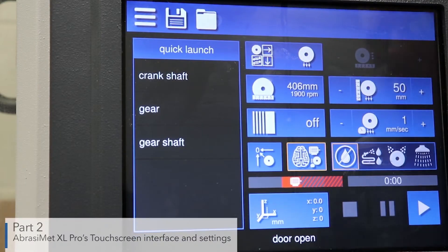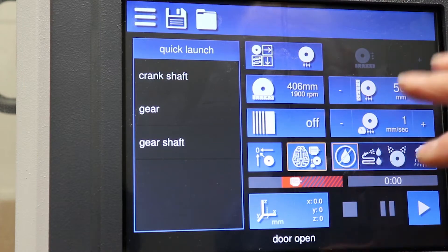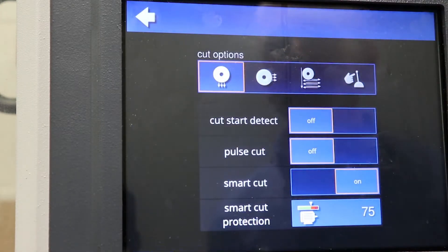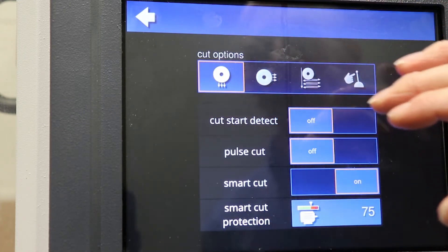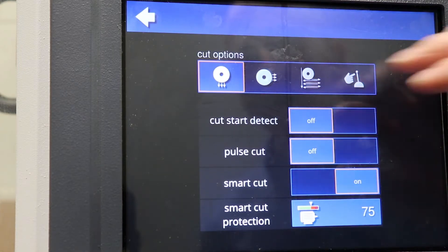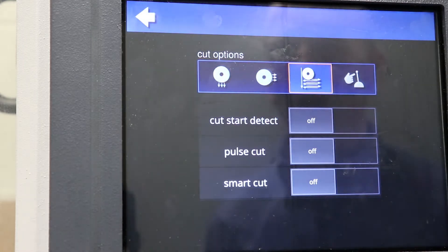This is the control panel for the Abracomat XL abrasive cutter — very intuitive and easy to use, with a touch panel for setting up all of the controls for a given cut. Some cut options in here: you can select your cut option very easily. This would be for cutting in the Z direction — a typical chop type cut. You can also set a Y cut where the vice bed advances toward the blade and cuts in the Y direction. There's also a plain cut.